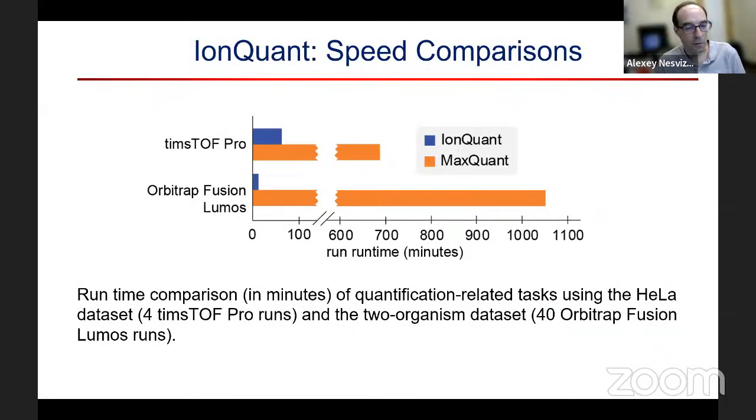So that's the single-cell data. And we demonstrated this across a wide range of data sets. Others use this now on timsTOF data on thousands of runs. There is a Cell paper from a consortium, the COVID consortium in England, where they run our pipeline. I mean, the pipeline is adopted now by many labs, and there are a lot of independent benchmarks that people published that you can go and look up. Because everything that we show, of course, we're a little bit biased. So we should look at what others get with our pipelines, and you'll be pleased to see that it actually works well.